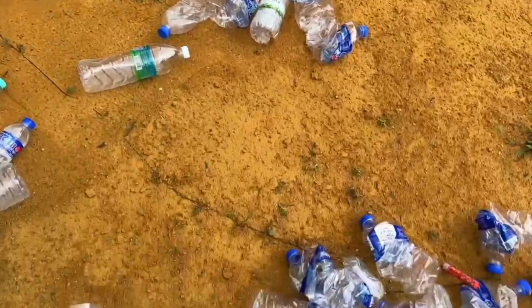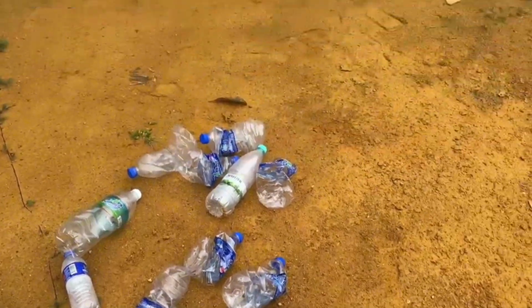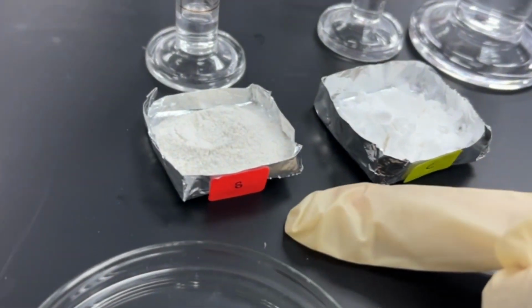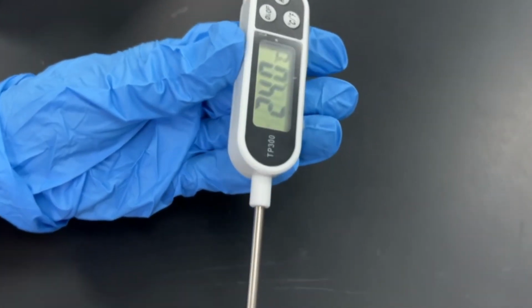The objective of this experiment is to produce bioplastic using potato starch and identify the characteristics of bioplastic from potato and commercial starch. Now, let's see how to make bioplastic. Before that, these are the materials and apparatus used to make a bioplastic.